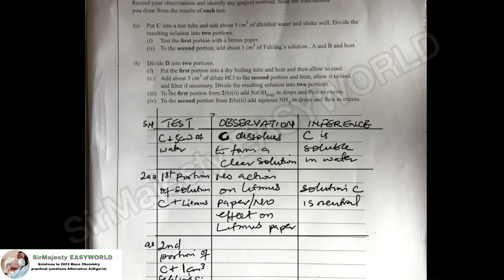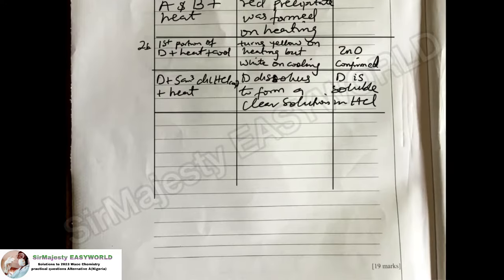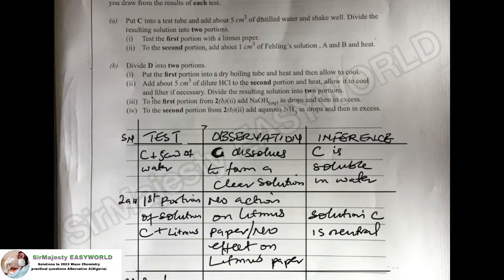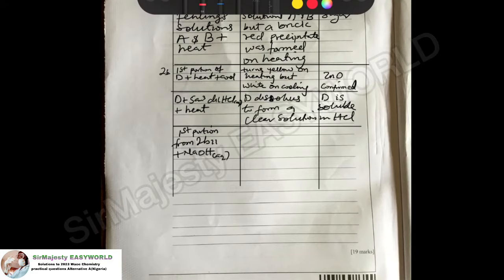So first portion from 2bii plus aqueous sodium hydroxide, in drops, then excess. Okay, you have to repeat aqueous here, in drops plus excess. They are testing for zinc, of course.